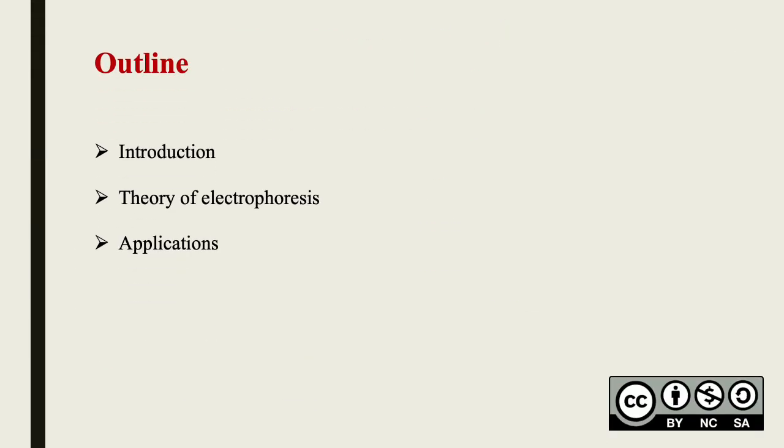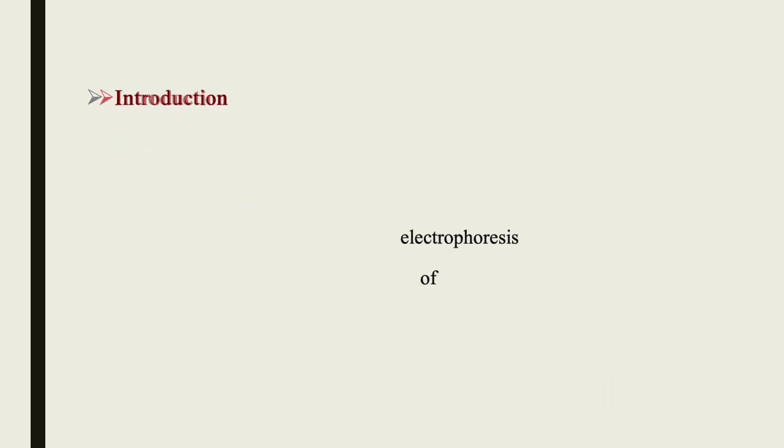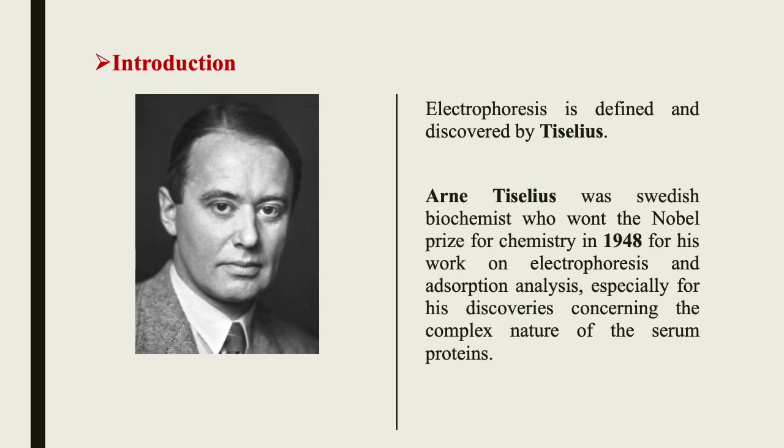So let us start with the outline. First, I will introduce what is meant by electrophoresis. Then I will cover the theory of electrophoresis, then applications. So let us start with the introduction.